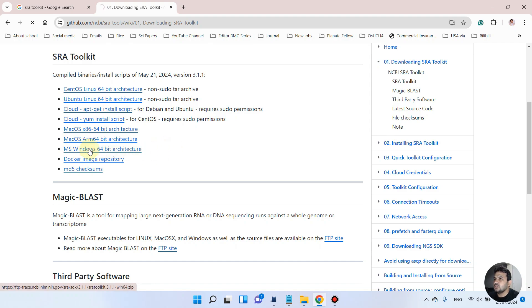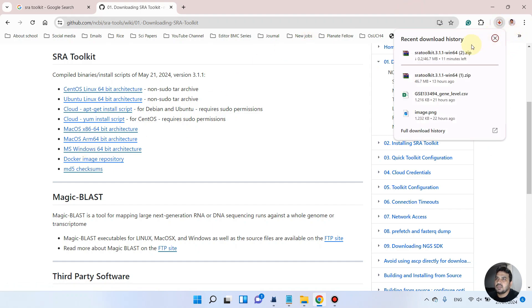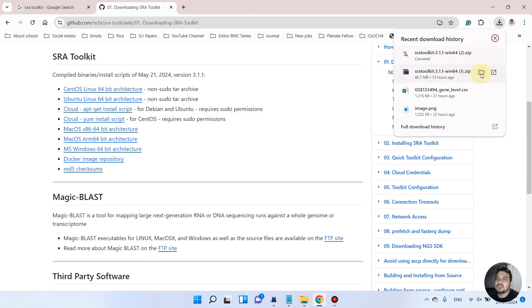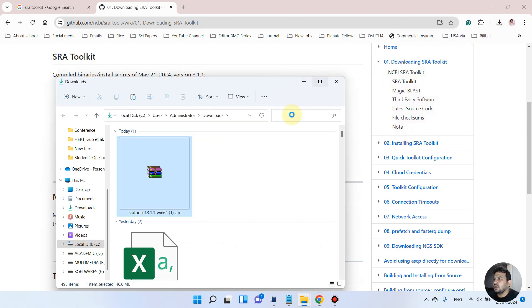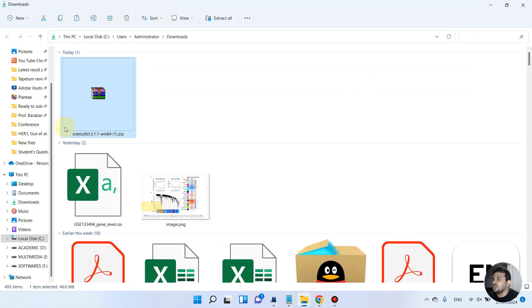It will start to download the file. As you can see it has started to download SRA Toolkit, but since I have already downloaded this I will stop it and open the existing file in our downloads folder.